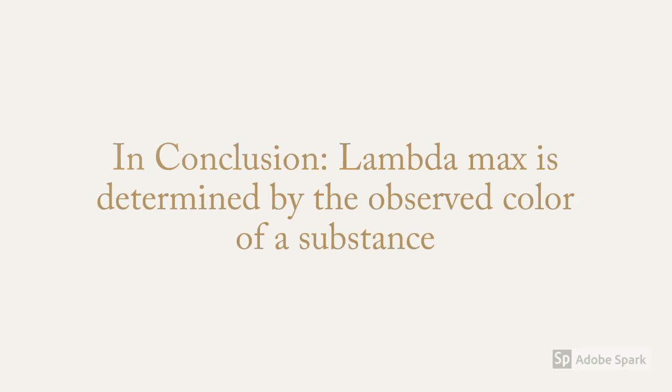The lambda max for the green and red dye are between the range of wavelengths observed in the visible light spectra. Therefore, the color of a substance does determine its lambda max.